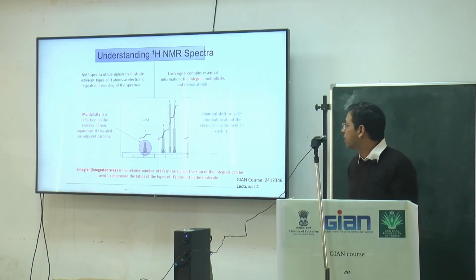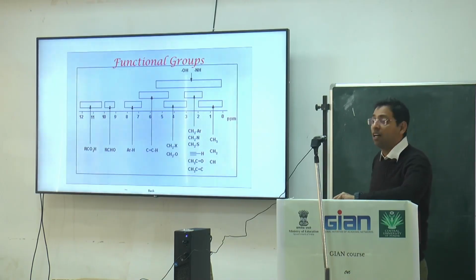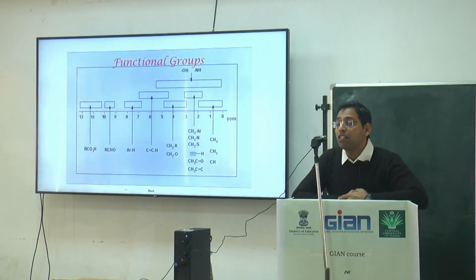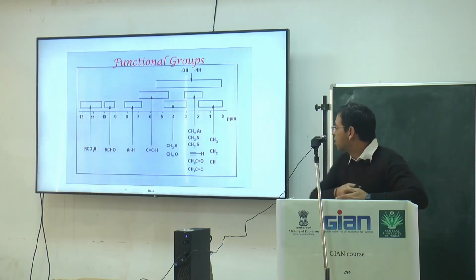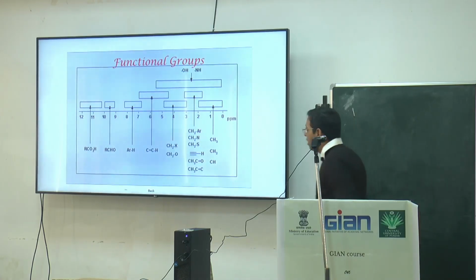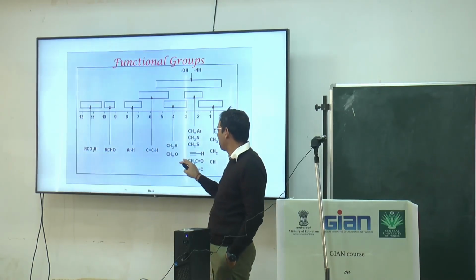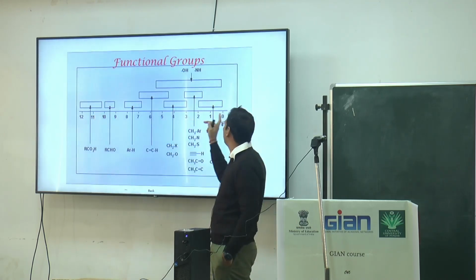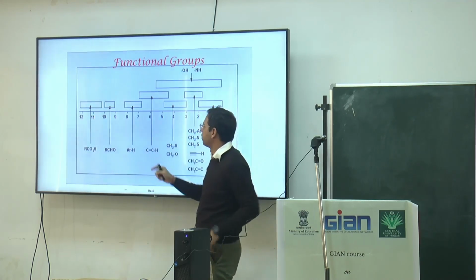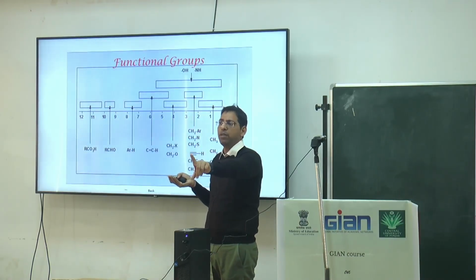Now these are the different functional groups which give you different areas in the NMR spectra that you can cover. You will find that more complex components have spectra far away in ppm. They are giving ppm at 12. And as I told you, you have to cover 2 to 8 maximum up to there. You are covering the proton behavior here.